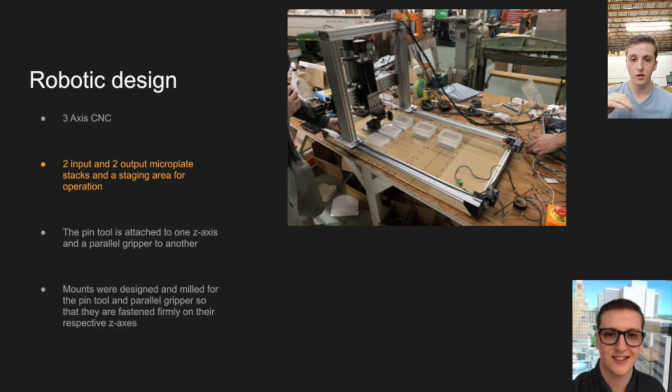Right now it is a 3mm sheet of acrylic screwed into MDF. Eventually it's going to be just 1 sheet of aluminum that I'm going to mill, but because of how hard it is to manufacture and how long it would take, right now we're just using acrylic in MDF, and that works great, but it isn't as easy to keep sanitized with MDF, so that obviously will have to change and be aluminum eventually.